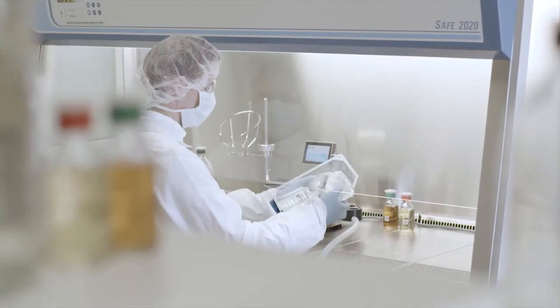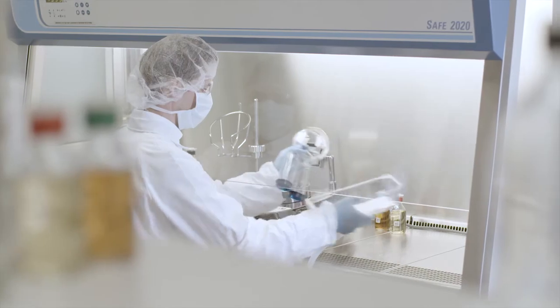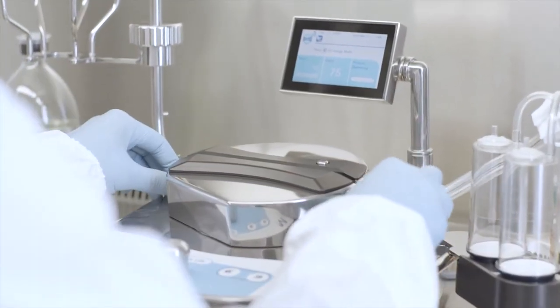With the pump's low height and ergonomic design, the loading with SteriTest EZ filtration units is extremely easy.